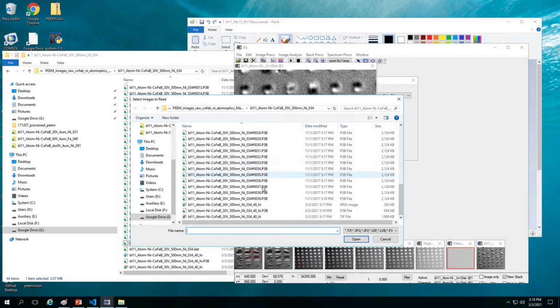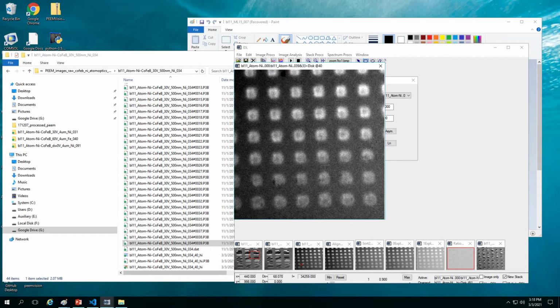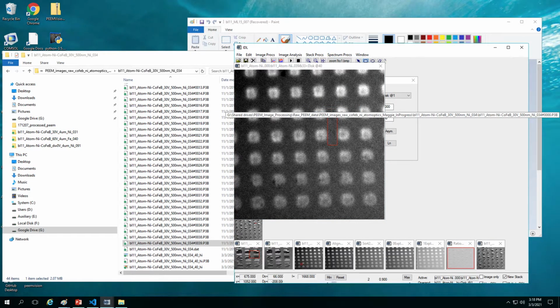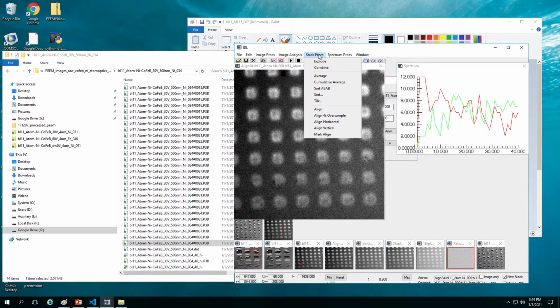Okay, what you would do is, let's try it. And maybe pick a different location for the alignment. Yeah, we want to try our best to generate the low and high resolution pairs as good as we could, so it's better for our later model training.